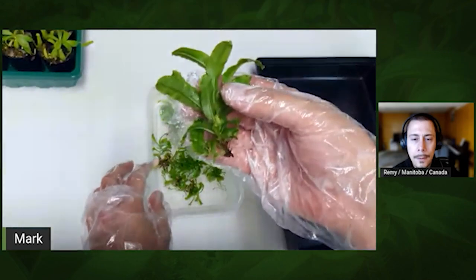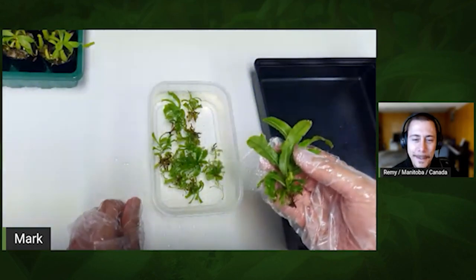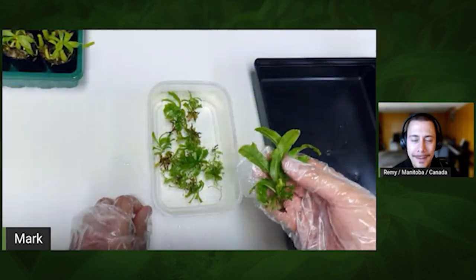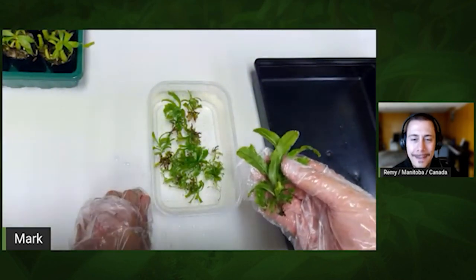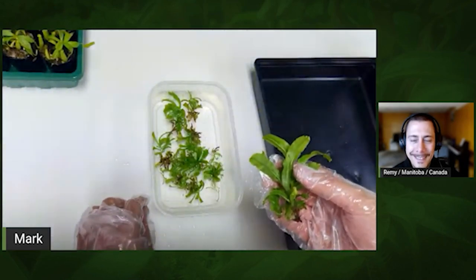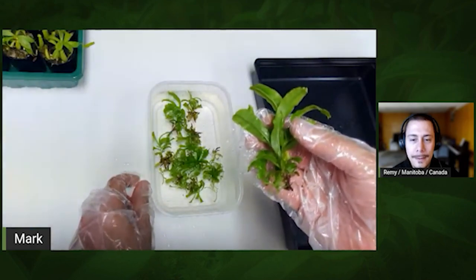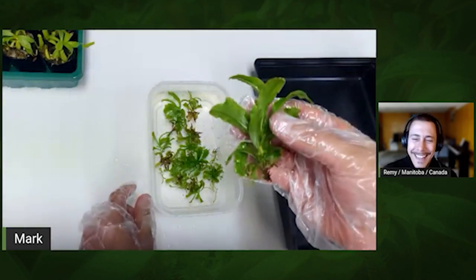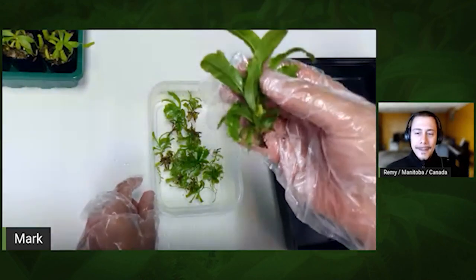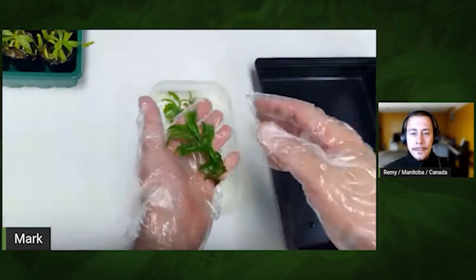Think of it like spoiled children — if a teenager was growing in his mother's basement, playing PlayStation for 16 or 17 years, never leaving the house, ordering pizzas, and then suddenly you tell them they have to go work in a workshop, they will get shocked. So, the bigger they are, the more difficult to adjust. We'll hope for this one — after six weeks we can check back and see how it goes.